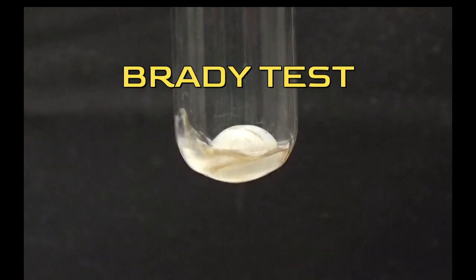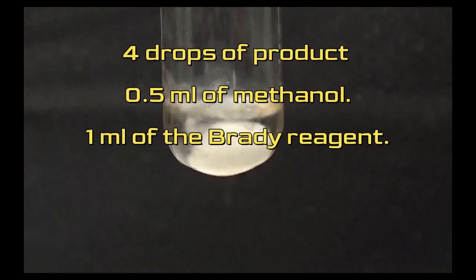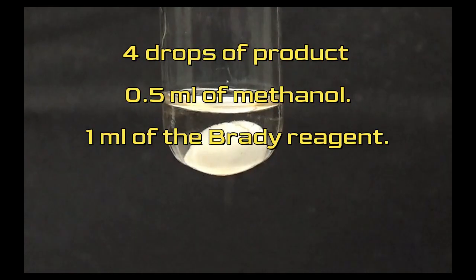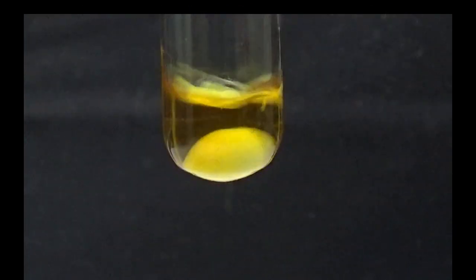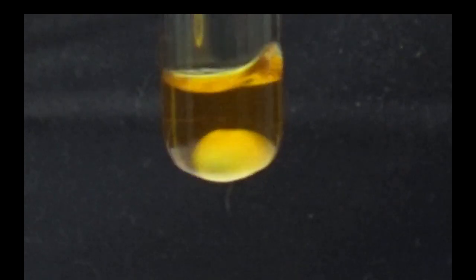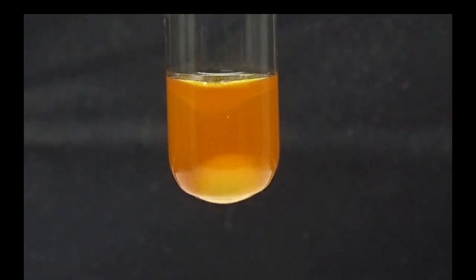For the Brady test, we will put 4 drops of product into a test tube and 0.5 milliliters of methanol. While agitating vigorously, add 1 milliliter of the Brady reagent. Let stir for about 10 minutes until the appearance of a precipitate orange hydrazone. Brady's reagent reacts with ketones and aldehydes to form insoluble hydrazones.